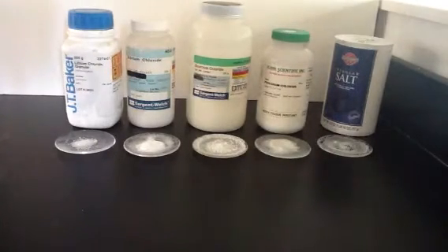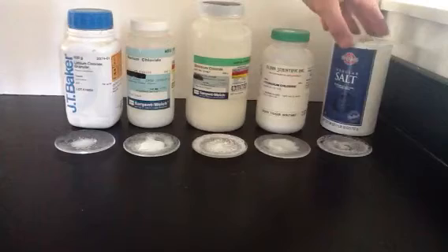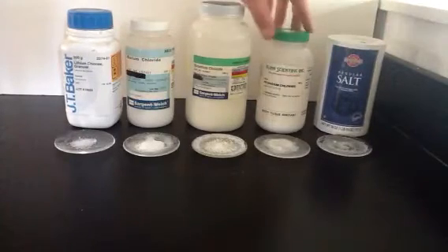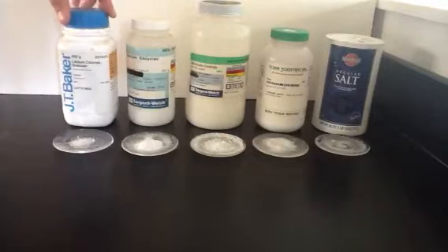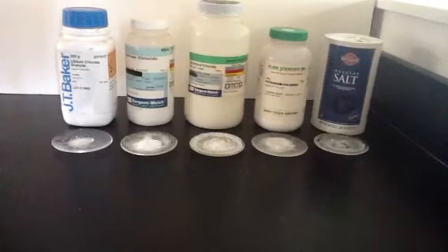This is the flame test lab. We're starting with sodium chloride, potassium chloride, strontium chloride, barium chloride, and lithium chloride. We're going to test what each of these ions does as it is burnt.